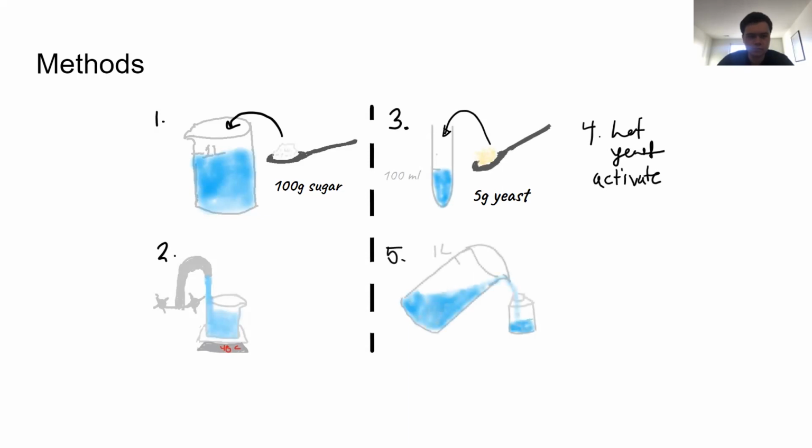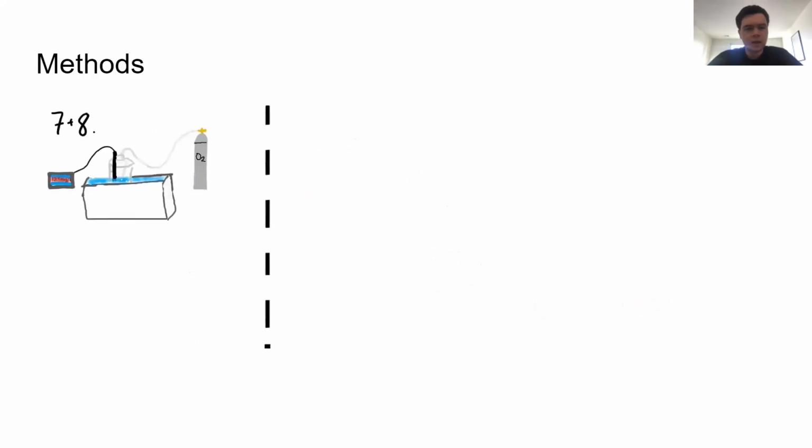We then poured 25 milliliters of purely sugar solution into our measuring container, in which we would measure the dissolved oxygen using a Vernier dissolved oxygen probe. We had 3 levels in total. Our control level of no oxygen added was between 9 and 11 milligrams per liter of oxygen. We measured our next level, in which we bubbled in oxygen from a tank, to have DO values of greater than 12.6 milligrams per liter.